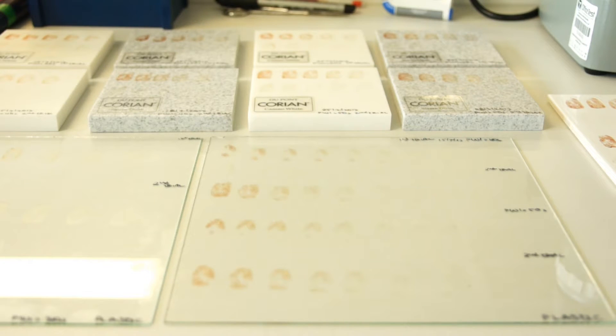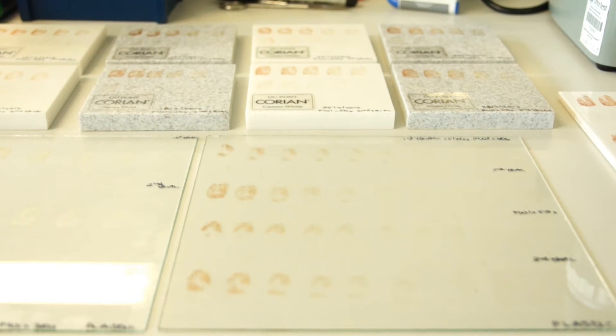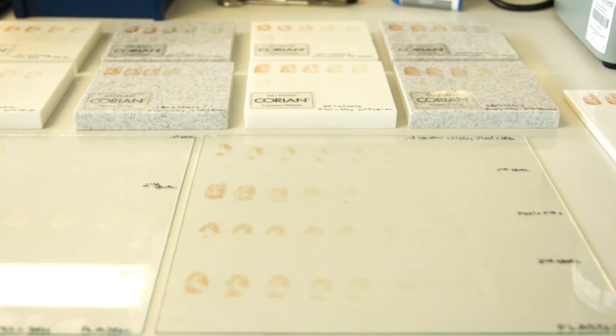Here I'm trying different drawing times on different types of tiles. For example, here we have 40 seconds drawing time, here 50 seconds, here 30 seconds, and here again 40 seconds. I'm examining each mark separately and comparing it with a reference print to see how much of the detail I can get.